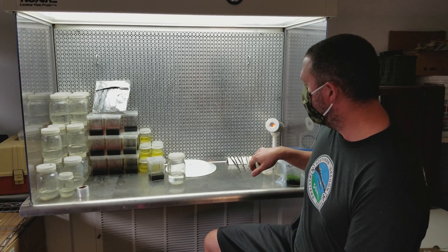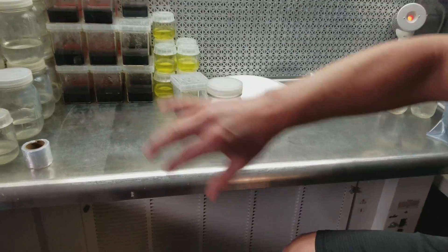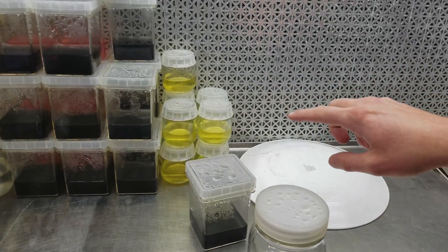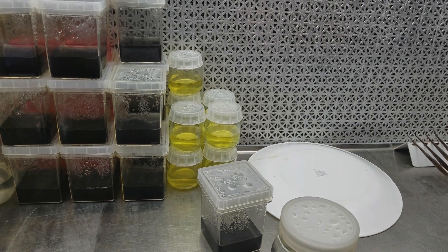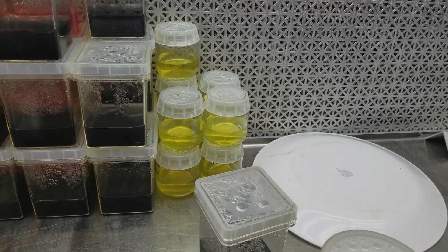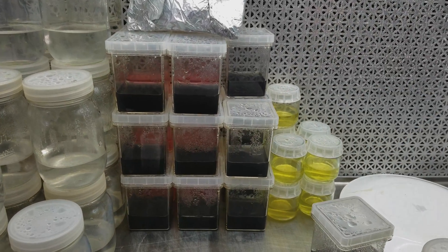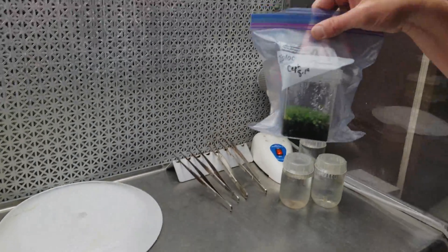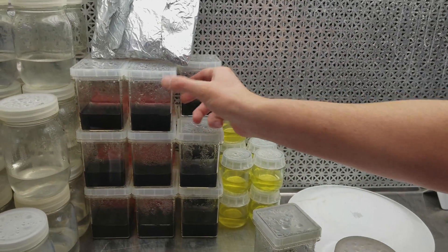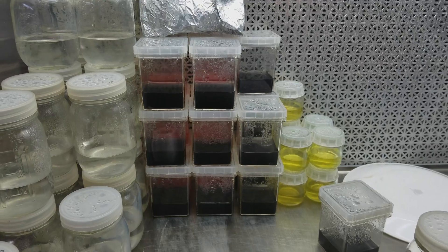This is a jar of sterile water — that's what all these Mason jars over here are. These are cultures, and I just use food coloring to signify the different types of media in them. The yellow one is what I'm going to use to initialize some Sarracenia later. The black ones are what I'm going to replate the Cephalotus culture onto.